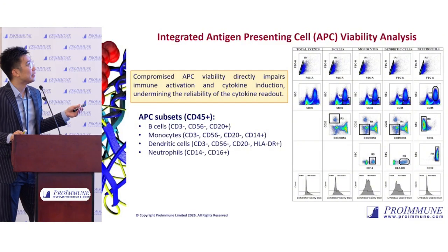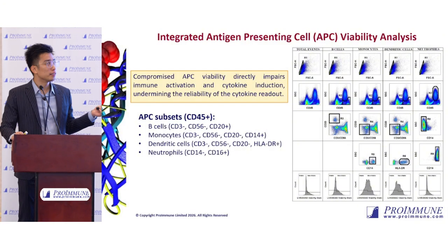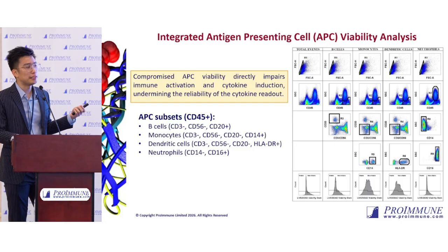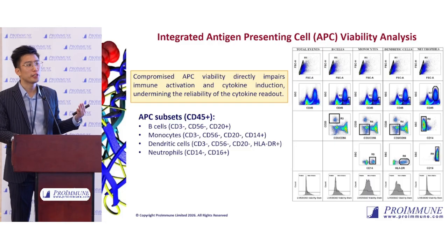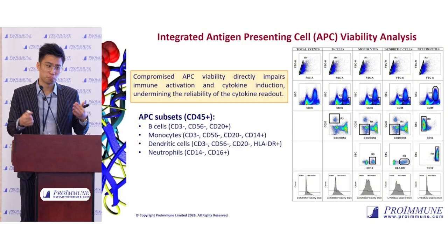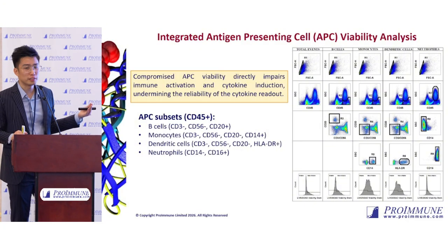So here I talk about the integrated APC viability analysis. The importance of this is also highlighted before. The agency is concerned that if your response is near 0, the question is whether or not this is really a reflection of the risk profile of your drug, or is it just because the cells have all died?